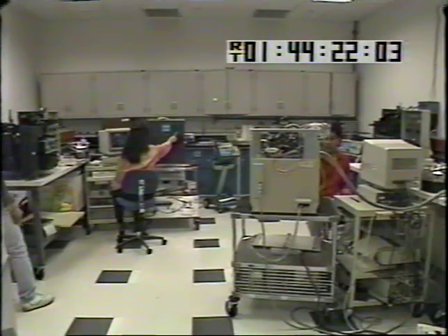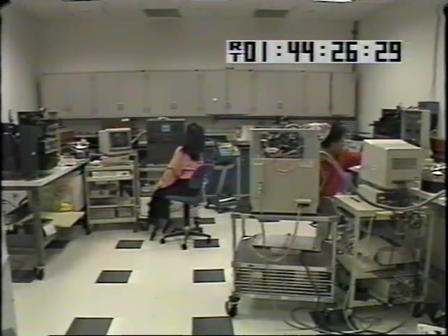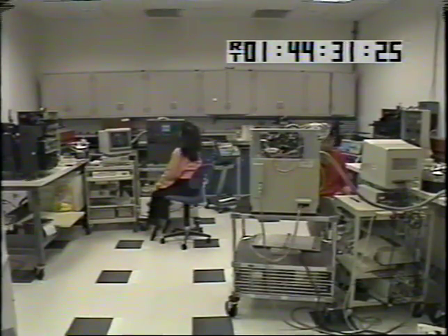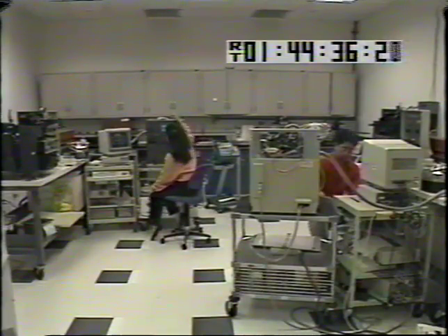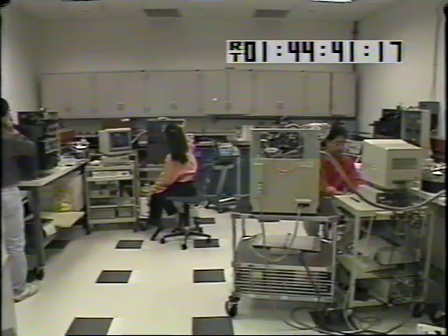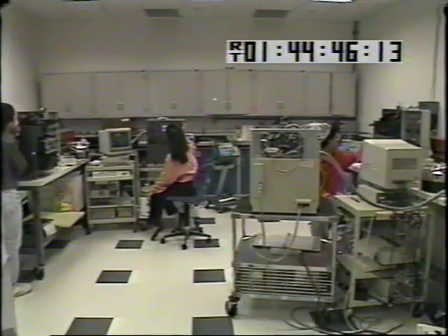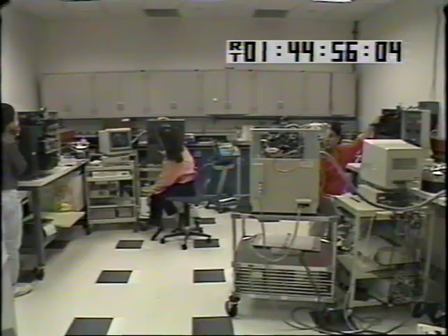Okay, we have now reached the system test lab at the side of the manufacturing area. For this particular filming, we've opened the doors so that we can see the lab in its entirety. Normally these doors would be shut as a safety precaution because lasers are in operation, and the light levels would be somewhat reduced as well. But what you see happening here is some typical activity that would normally go on behind closed doors in calibrating and aligning the FacStar Plus instruments.